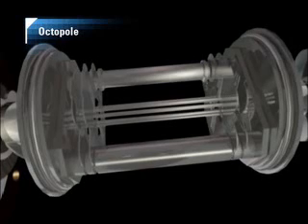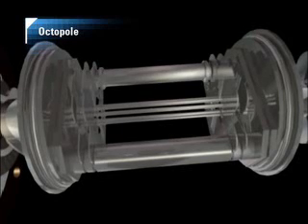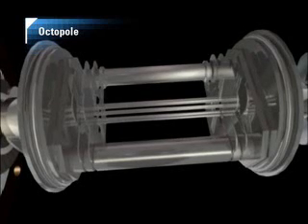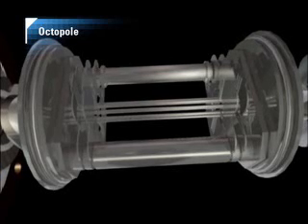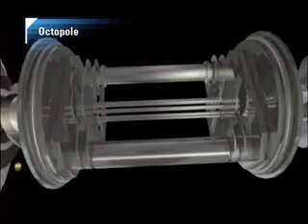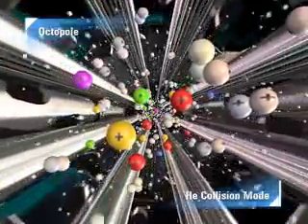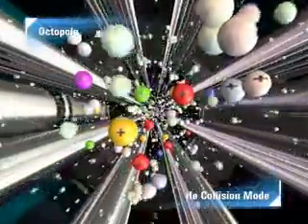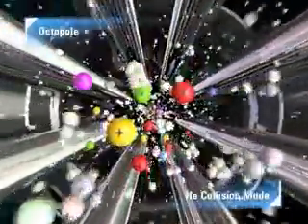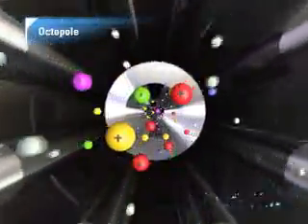Octopoles are small, reducing the size of the cell and allowing operation at higher pressure relative to other systems. This results in more ion-gas collisions and greater interference removal efficiency, which also enables the ORS to operate in collision mode using pure helium collision gas. The larger polyatomic interferences collide more often with the helium atoms than the analyte ions and lose more kinetic energy. A potential barrier at the cell exit allows only the higher energy analyte ions to pass through to the mass analyzer. The low-energy polyatomic ions are prevented from leaving the cell by energy discrimination.